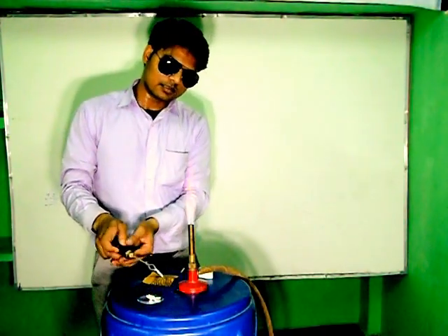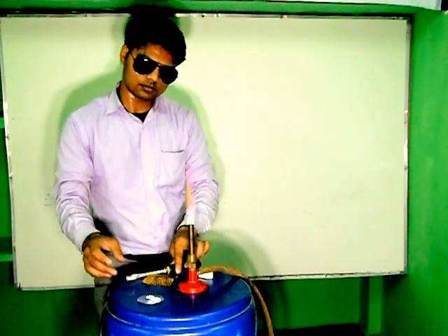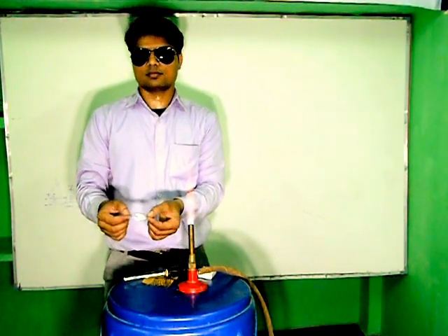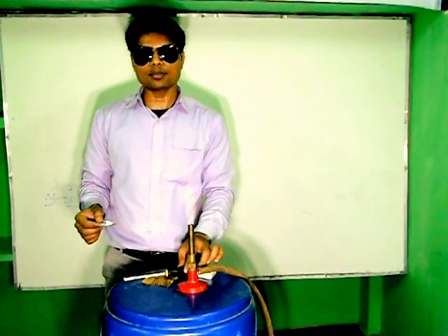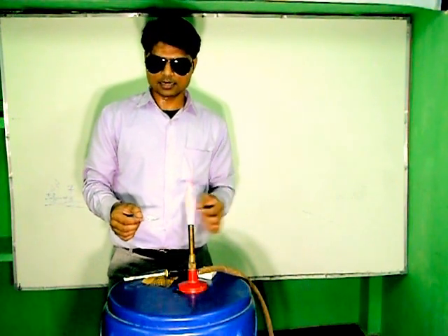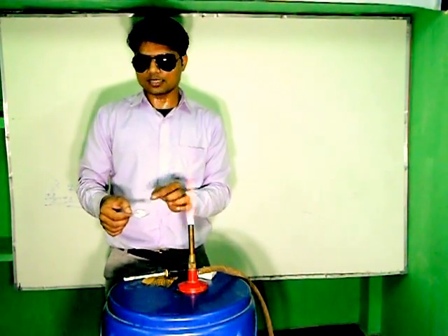The Magnesium Riven has burned completely. Now see, this is the Chinatis and here is the white S. So what happened in this reaction? The reaction is completed now. The Magnesium Riven, when Magnesium burns in the presence of Oxygen, forms Magnesium Oxide. So this is Magnesium Oxide.